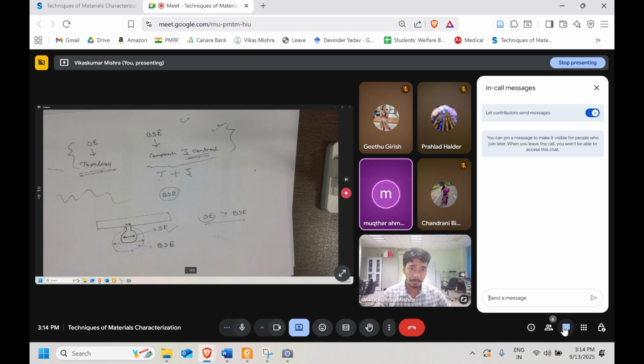Right. Okay, good. Then one more doubt I have in stereo microscopy. Also, we are tilting to get slightly two different images, like our two different eyes see. So here also I have the same question. That small tilting, what is the angle I can apply? Is there any control by tilting, or which side or which angle?